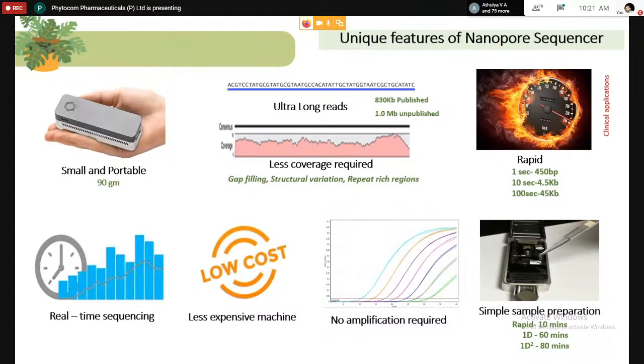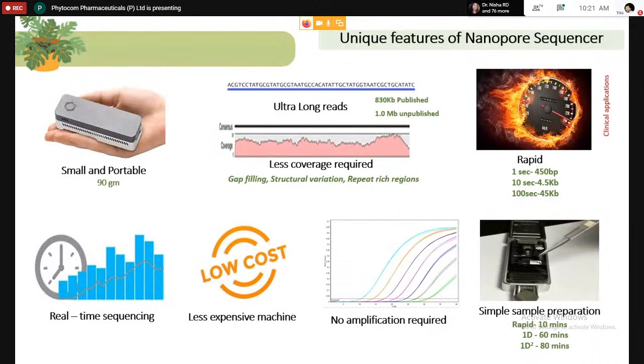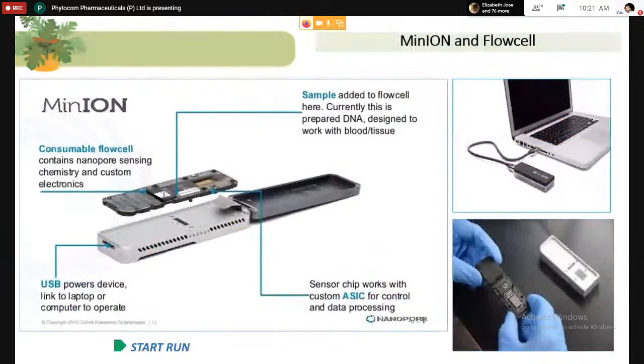I'll tell you, there is a small flow cell called the Smidgion. In that Smidgion, you can sequence a single sample, a small viral DNA or small bacterial DNA. That Smidgion flow cell you can connect to an iPhone, and the sequencing reaction will take only 10 minutes. Then that reaction mixture you can load into the flow cell, and if you are going to an agricultural field, you can directly sequence the sample there itself. 10 minutes at room temperature you can do it.